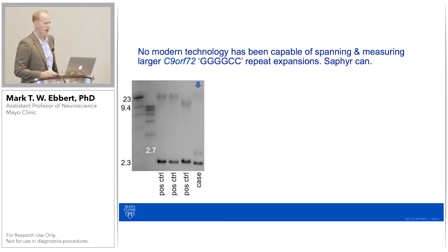So we picked a sample. We wanted to pick the hardest sample we could to try and challenge the Saphyr. So this sample, it's a bit faint, but there's a band up here that's greater than 23 kb.